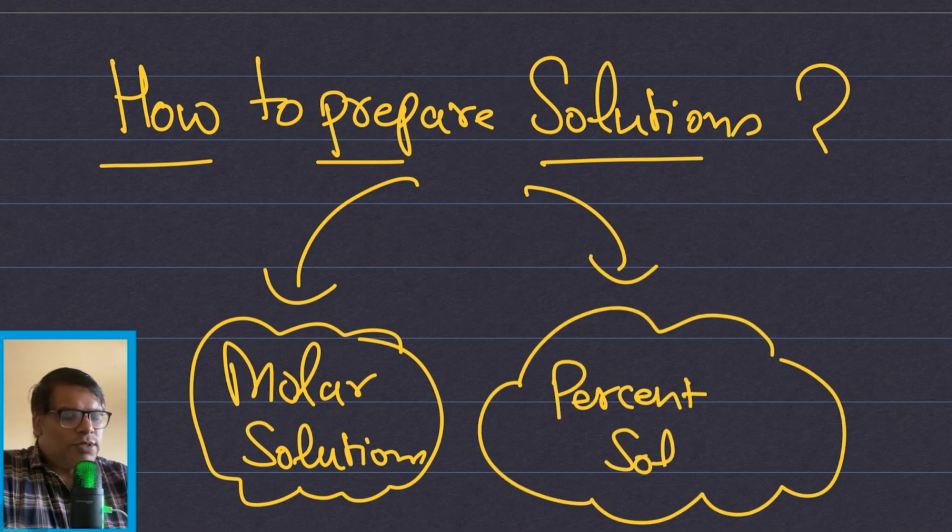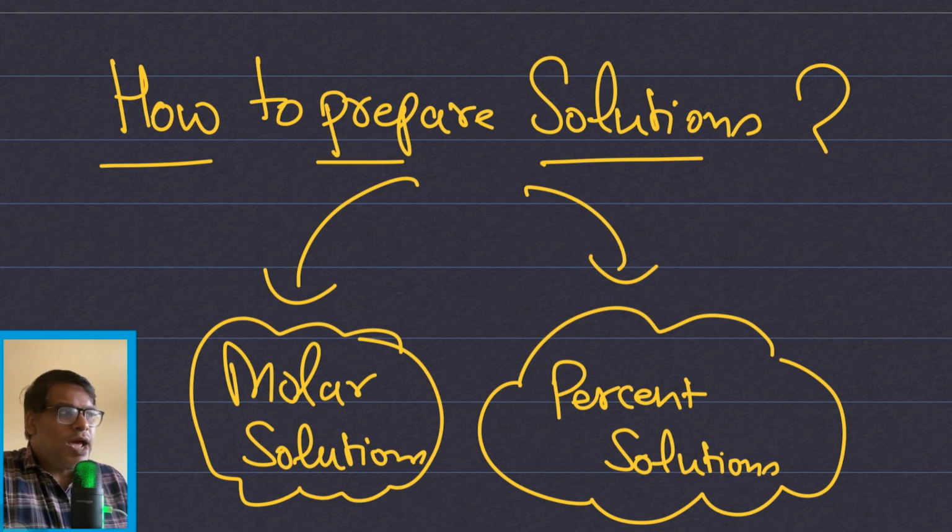Here I want to tell you, many times students make simple mistakes while preparing the solution, and they do not prepare the desired concentration.